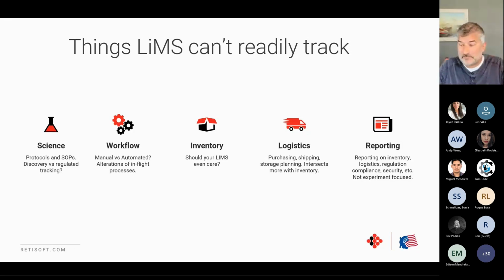So here are a few things that I've personally had conversations with groups about that they wanted to see that weren't handled by their existing systems. And in reality, the LIMS shouldn't be responsible for many of these things, as there are dedicated products or even full industries to manage some of these needs. Inventory is a great example. There are a ton of inventory systems out there. I have seen companies build many different inventory systems, each specially tailored to a specific lab or purpose.